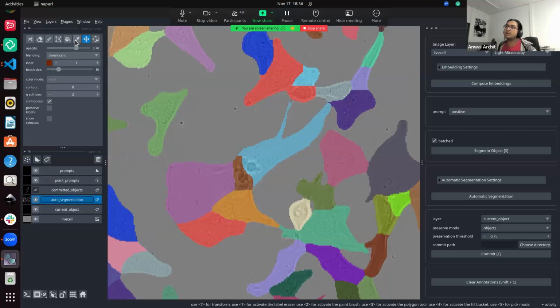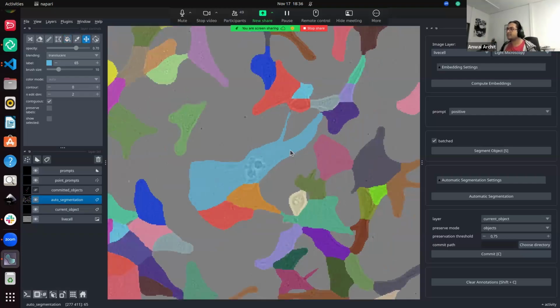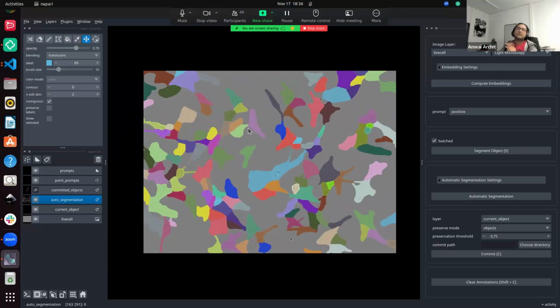So we stick to automatic segmentation over here. Now we go to the pick mode, which chooses a particular color. So out of all three splits, we can choose one of them. And then there's a fill mode, which kind of fills up or covers them in all consistent colors, which makes this pixel precise as one whole cell. This is the idea over here. So this is how I made a patch fix. And this would be everything for the 2D part.